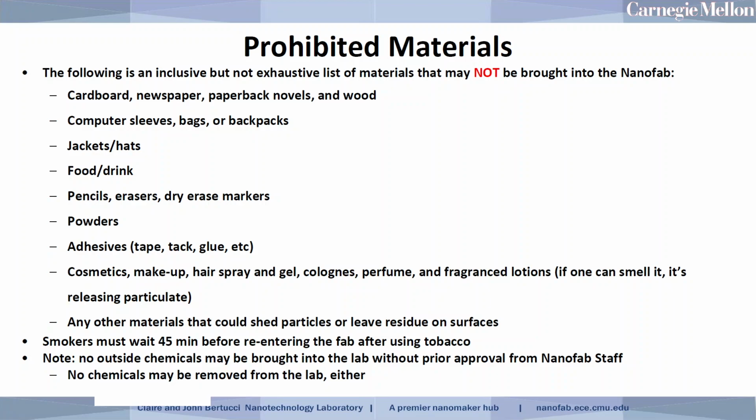We also ask that any smokers wait 45 minutes before entering the lab after using tobacco products. And the last bullet point here is really important. No outside chemicals are allowed to be brought into the lab without approval from Nanofab staff.